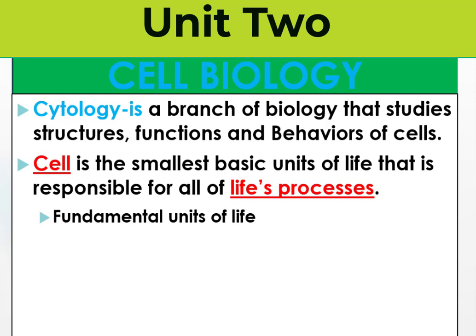In this lesson we are going to study the microscope. But before we talk about the microscope, let me give you an overview of cell biology. Cell biology, or cytology, is a branch of biology that studies the structures, functions and behaviors of cells.